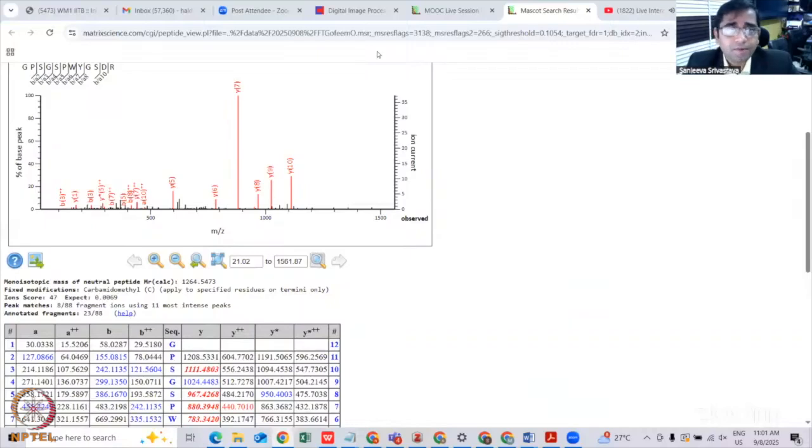So just in the final minute or so, students have also been asking us in which way proteomics is really getting more and more transformative using the new mass spec technologies. So what I'd like to mention to you is that our ability to really look at the proteome from a very small amount of protein, for example, as we just showed you in the timsTOF, using 200 nanogram or 3 nanogram amount of peptide, one could now look at a complex proteome of more than 8,000 and 10,000 proteins.